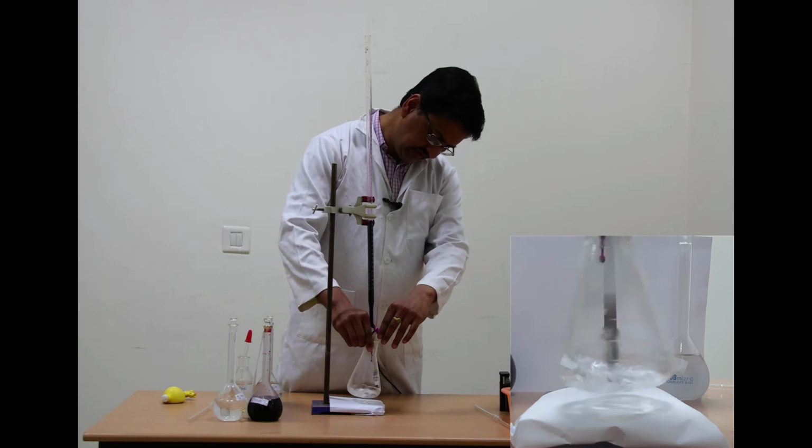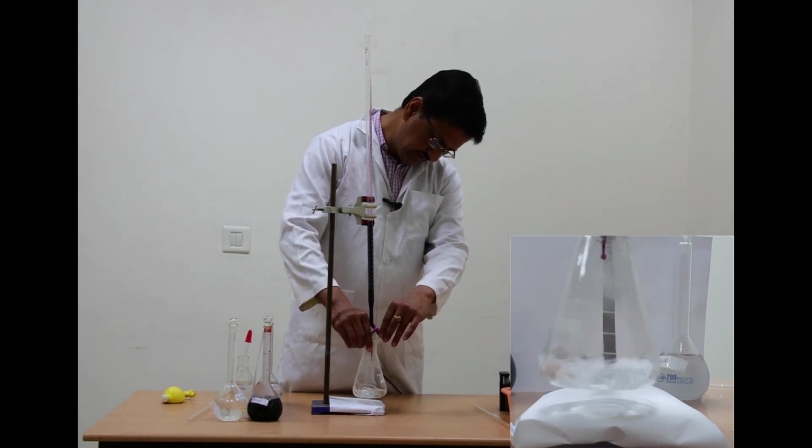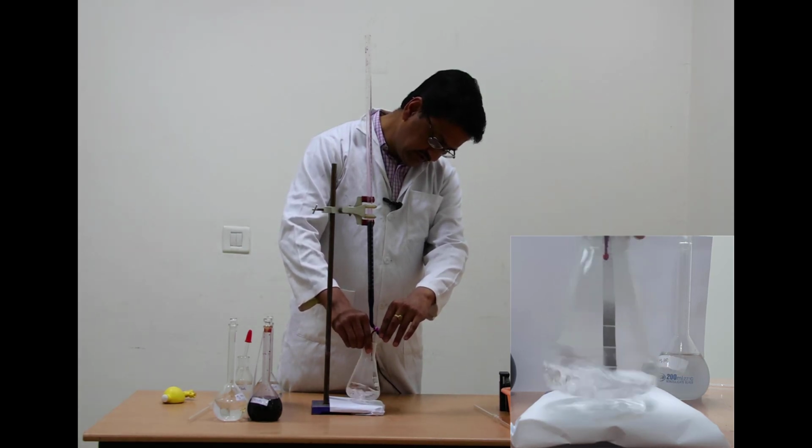Now you see that the color stays for a fraction of a second, so we are very close to the equivalence point. So we should only add one drop at a time and see whether it decolorizes immediately or not.